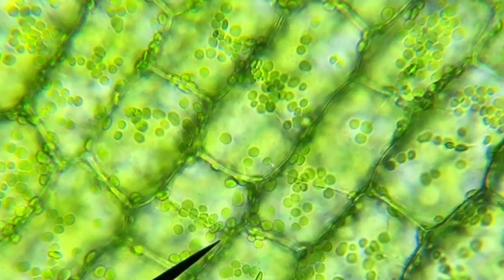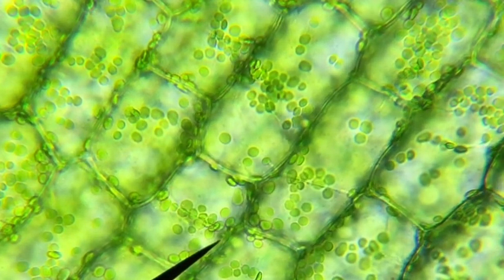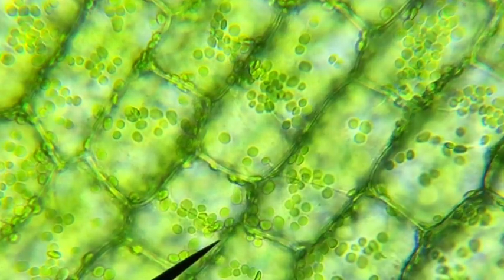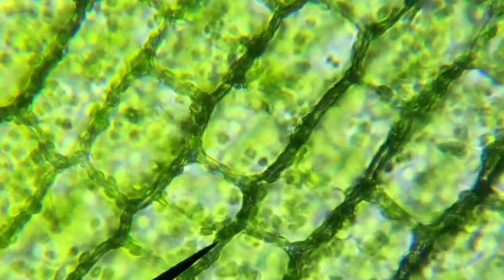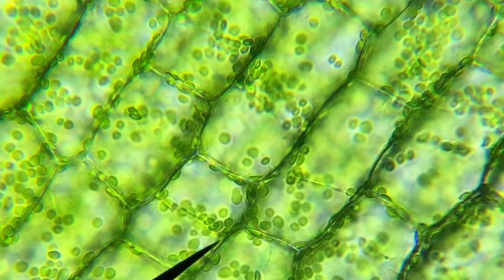The chloroplasts are even moving around inside the cell. The cell wall and cell membrane would be there as well. So that's the plant cell.